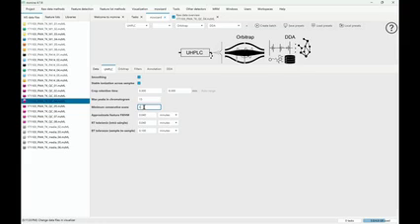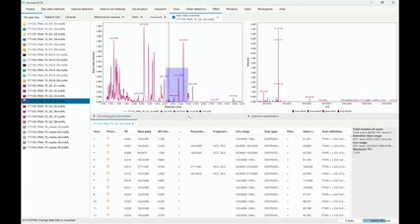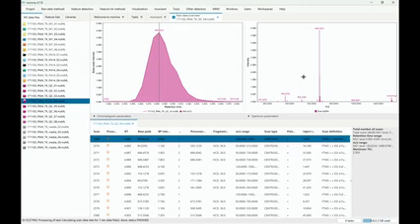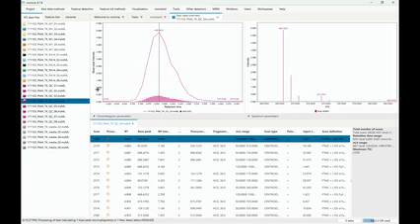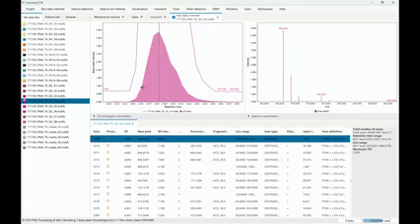If you have a very fast chromatography and your scan rate is very slow, you don't have so many data points on your peak. I will just show you how to get that. In that chromatogram overview, I can click on a peak. That's a big one, right? So it's going to have more data points than maybe some of the smaller isotopes. I could pick one of the smaller isotopes, and in here you can count the data points, like 1, 2, 3, 4, 5, 6, 7.